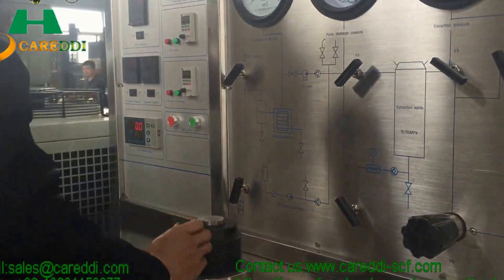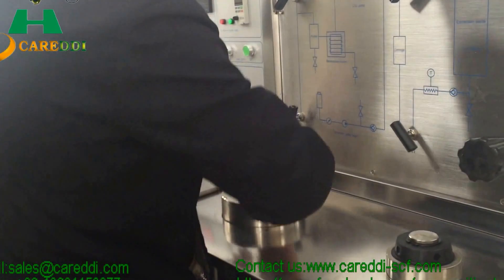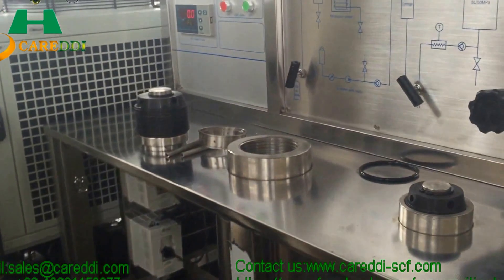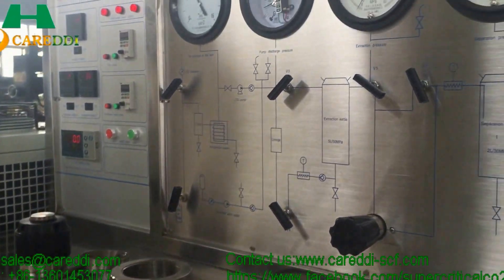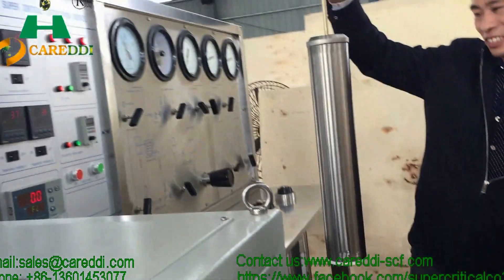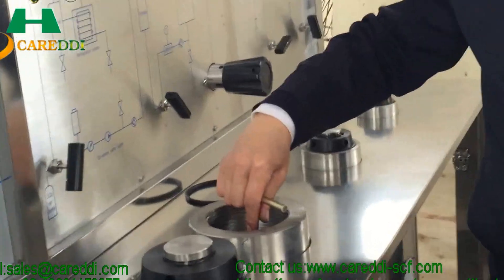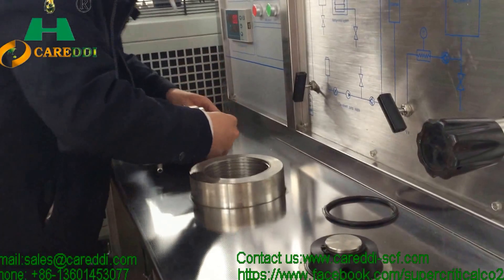Open the cover or the door of the extraction tank. Take out the gasket and another safety device. The engineer is now putting the material tank into the extraction tank using a special metal device.